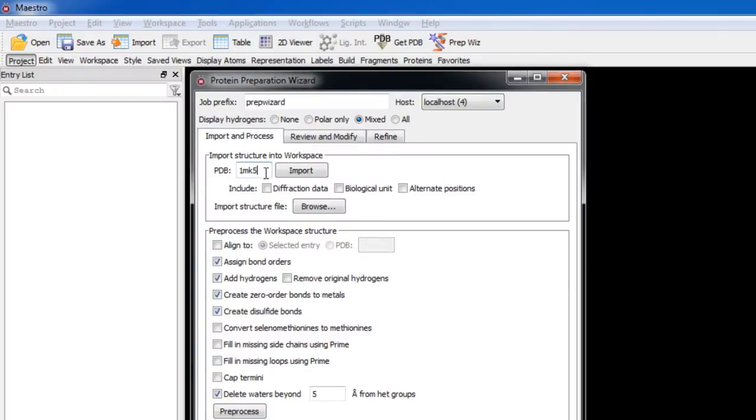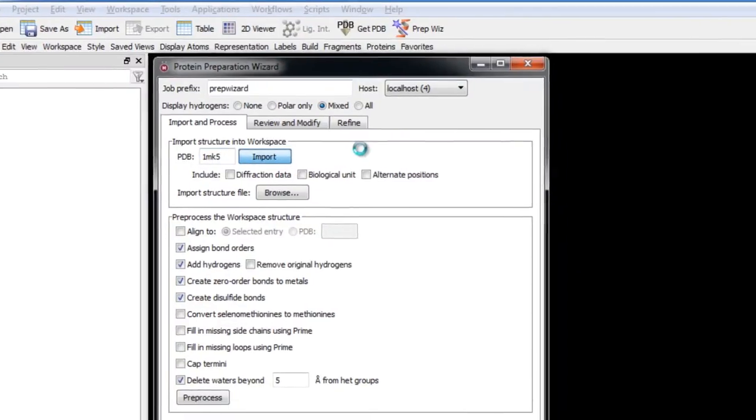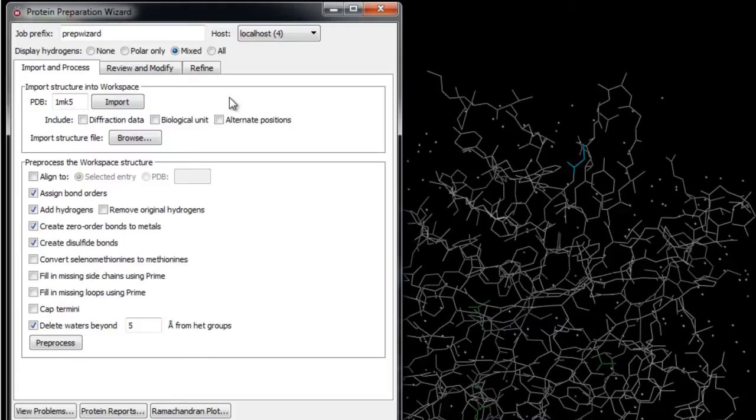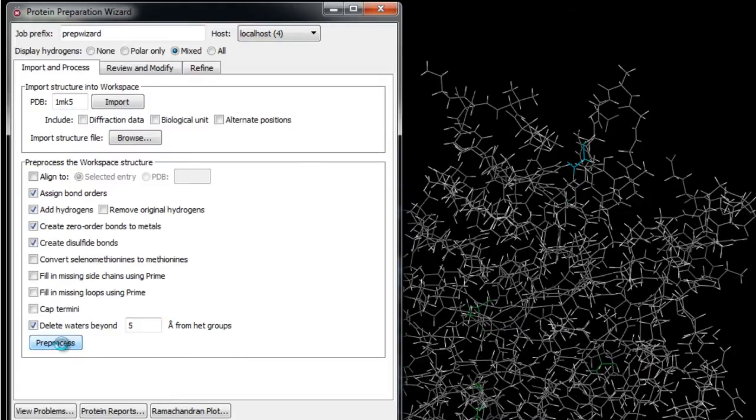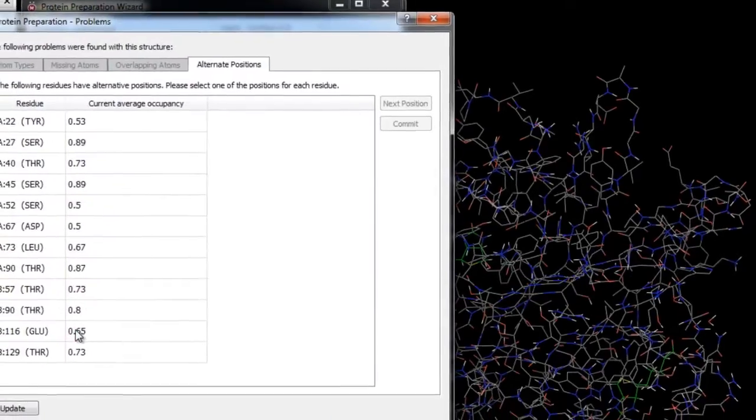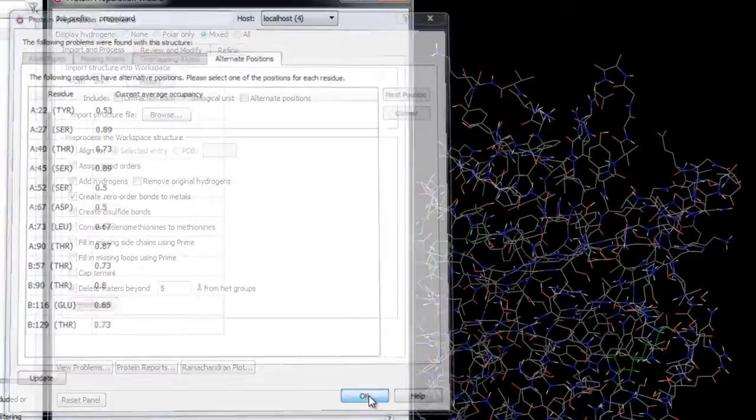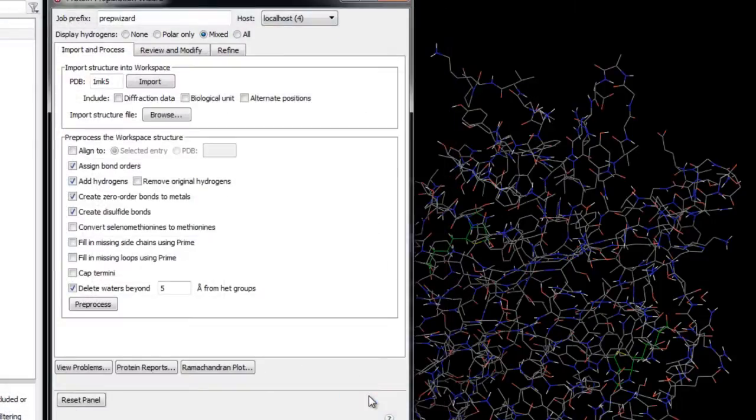For this protein we'll use the default settings for pre-processing, so we'll click Preprocess. Now it looks like there are some residues with alternate positions. We'll just click OK to use the current positions displayed in the workspace.